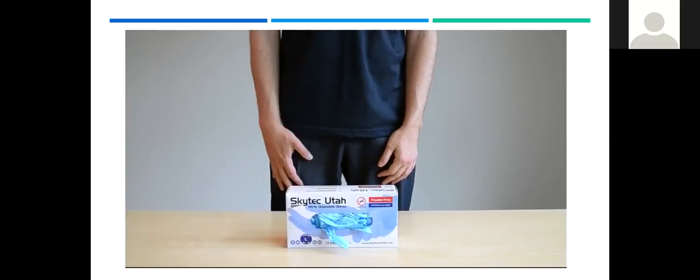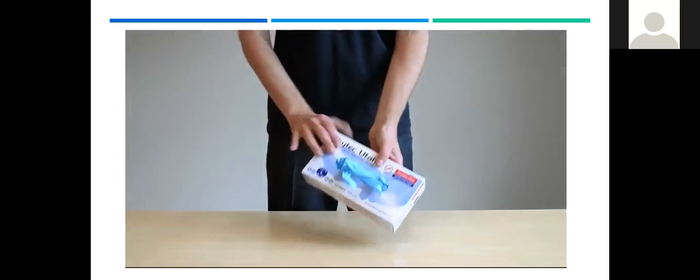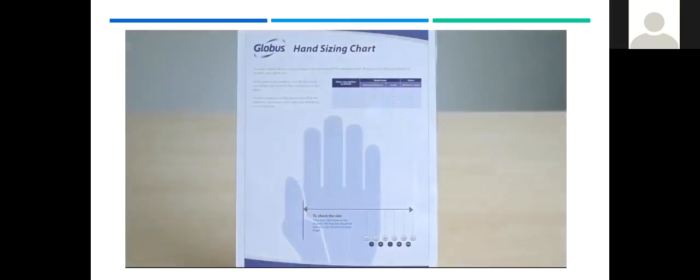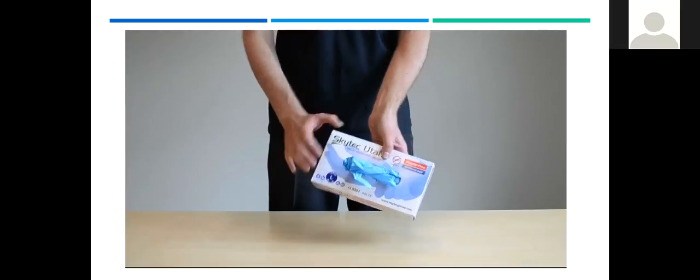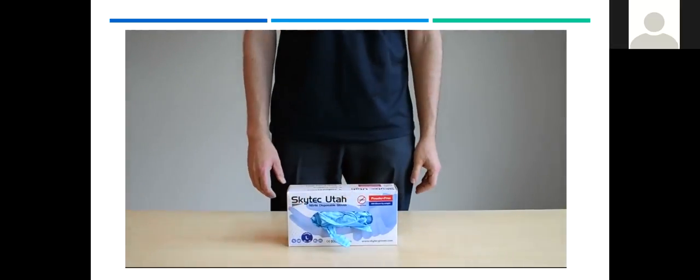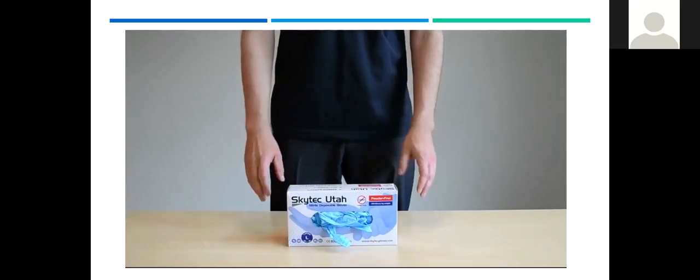Before using a disposable glove, always ensure the right type is chosen for the type of work and potential hazards. Make sure the right size of glove is used. Measure your hand using a glove sizing chart. Wearing the right size will reduce the potential for tearing and also ensure freedom of movement for the hand. Remove any jewelry that may rip the gloves, and wash your hands before donning gloves, as well as after each glove change.